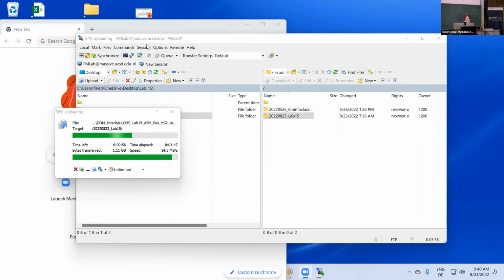Is it possible to maybe do some screenshots of the single steps? Yeah. We wanted to go through it live so you could interrupt us, but after this, I'll make slides as a reference. Yeah, for sure, we'll do that. I mean, what might be interesting for you, while we stream it, we also record it, so we might upload it.